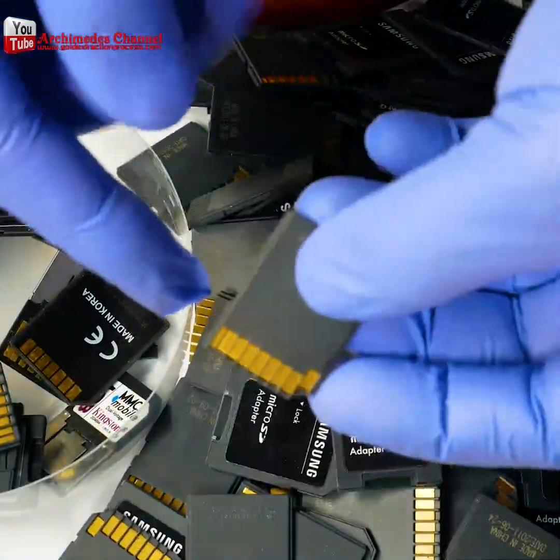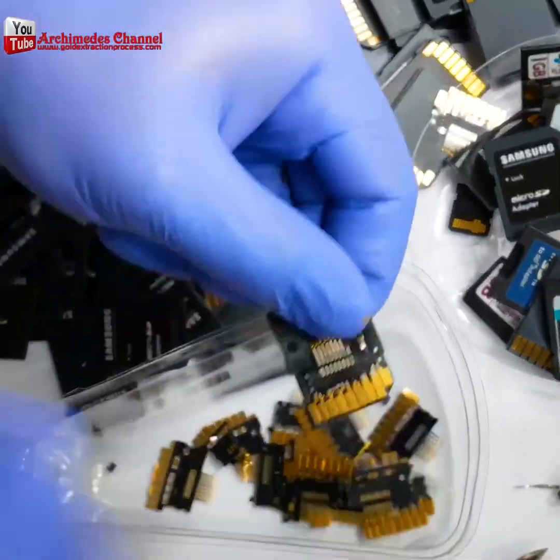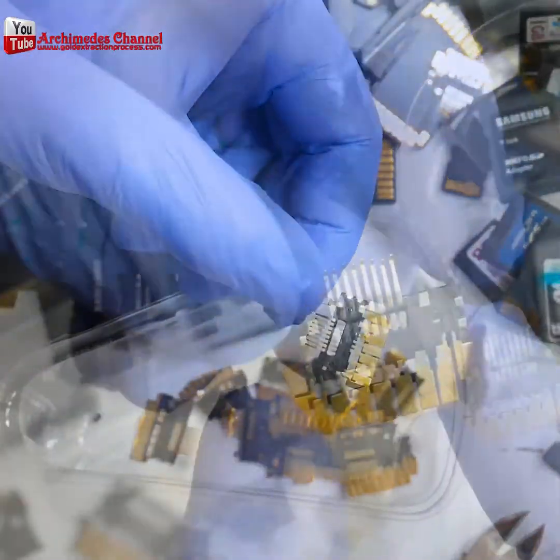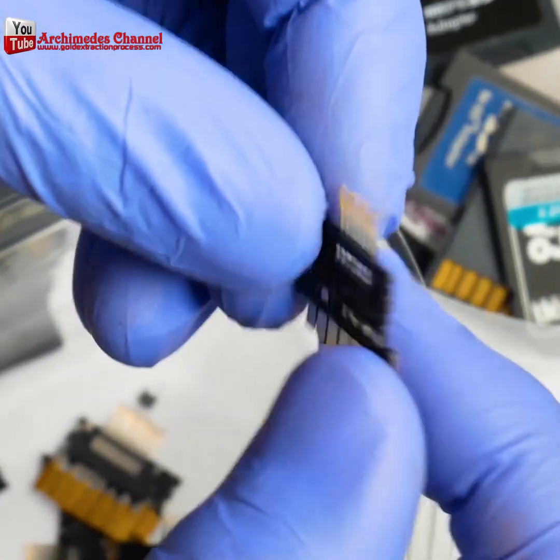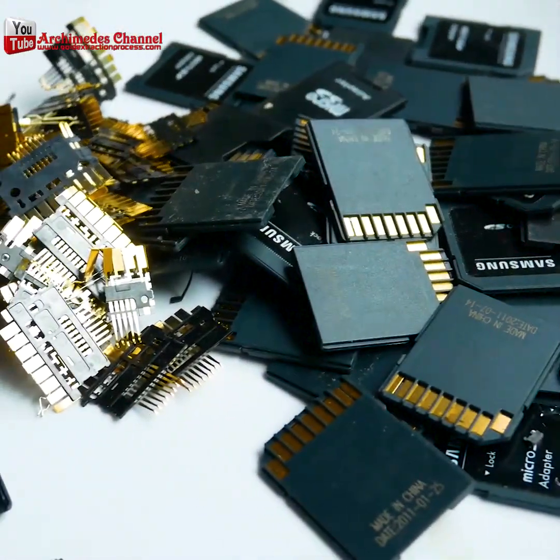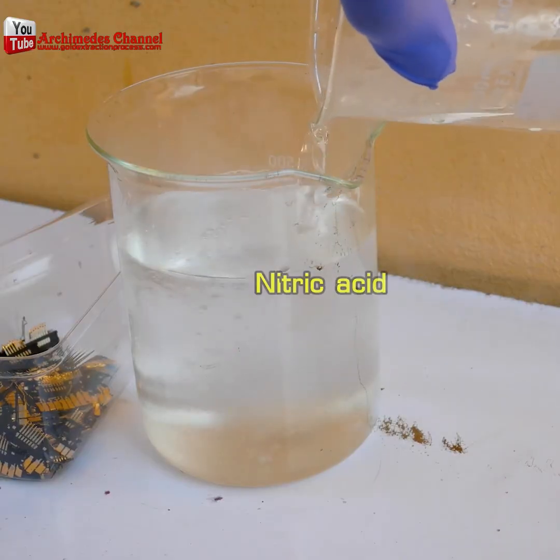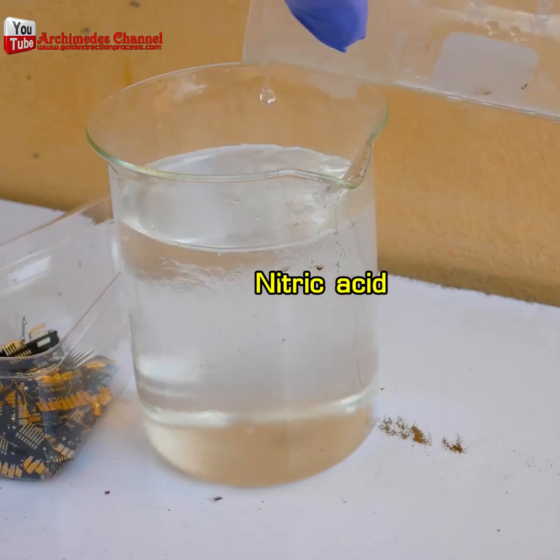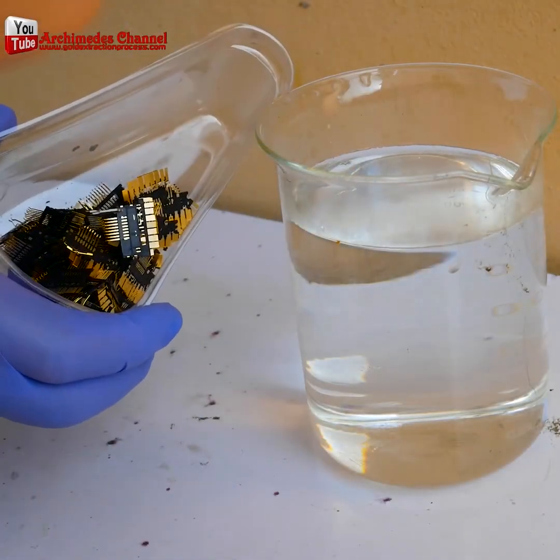How valuable is the information stored on your micro SD card or your micro SD cards? Is it more valuable than gold? If not, then maybe you want to take a swing at extracting gold from all the cards you've got. The first thing you'll need to do is mix up a nitric acid solution that'll melt away all the impure metals.